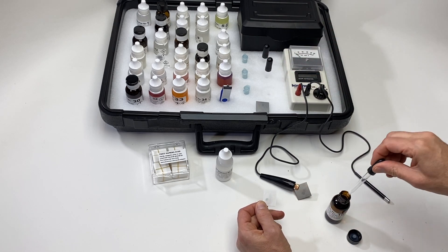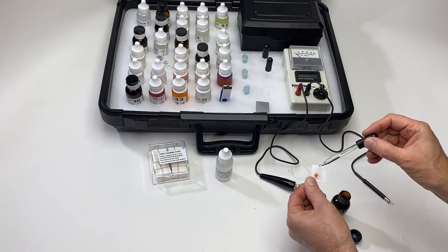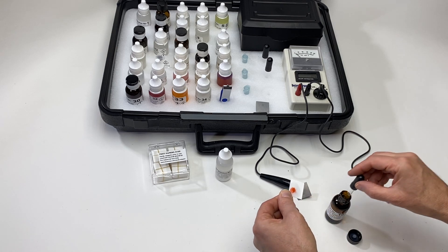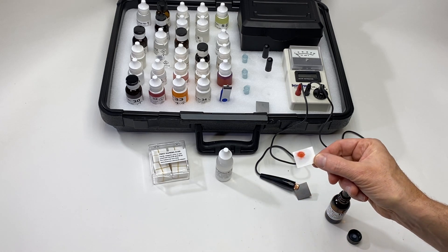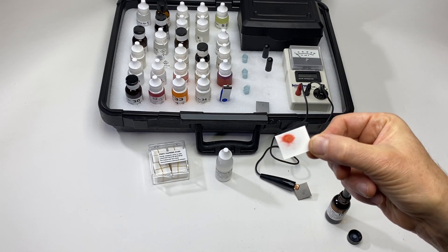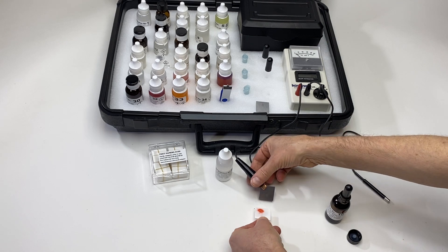I could use up to five drops — one, two, three. With three drops it looks like quite a bright spot. So I'm going to say that this metal sample contains a lot of iron.